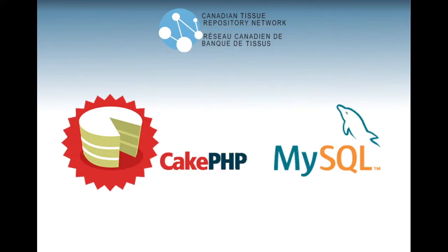The program runs on a Cake PHP framework written in PHP and Ajax and is compatible with MySQL. Atim is an ideal platform to manage all biobank needs. It can be run in multiple languages and also uses international standards like ICD-10 and ICD-O3. The platform is fully customizable, so each biobank can maintain its autonomy.